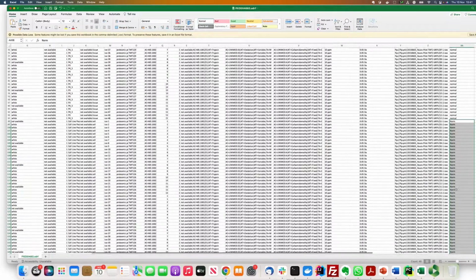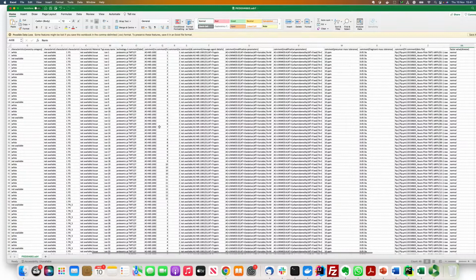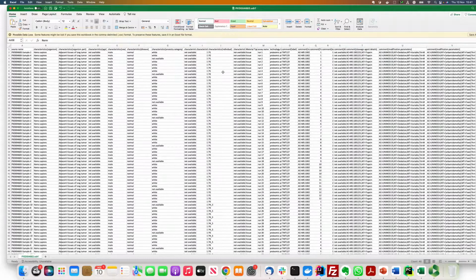normalization against those channels. Because this pipeline Quantms is so tightly coupled with MSstats, we know that when one condition is recognized as norm, then it's used as a pool, and that's what is described in that case. Then you have at the very end the quantitation, but the beauty of this is that you also have all the information about the experimental design. In this case, we don't have that much because this is a post-annotated experiment, but in your own experiment, you know what is there.